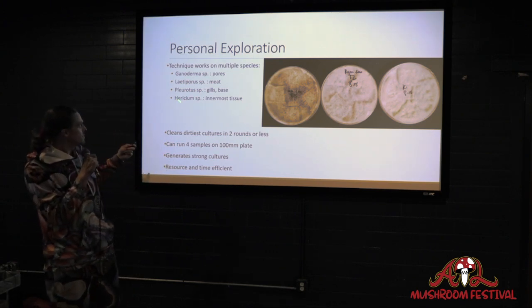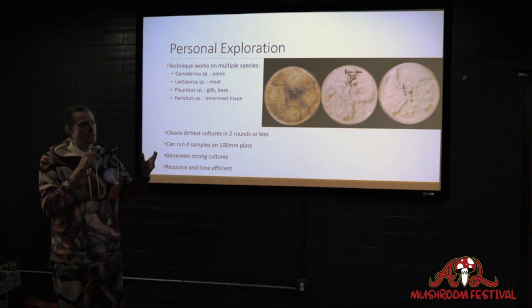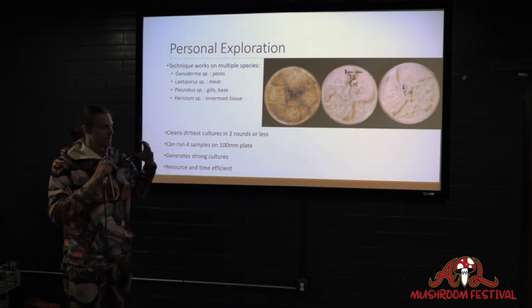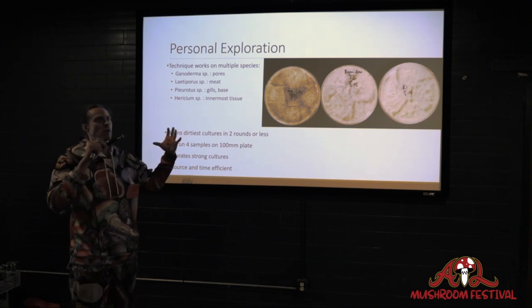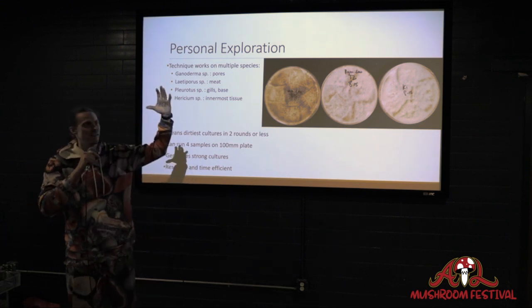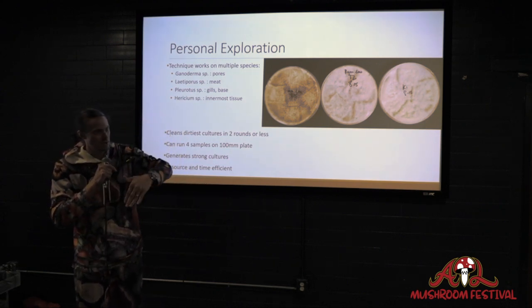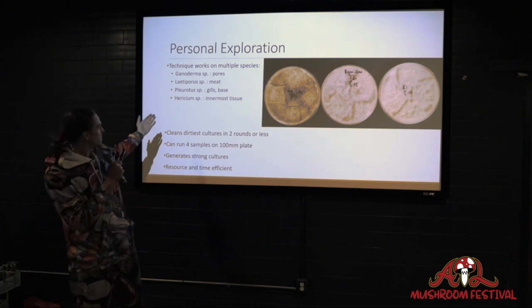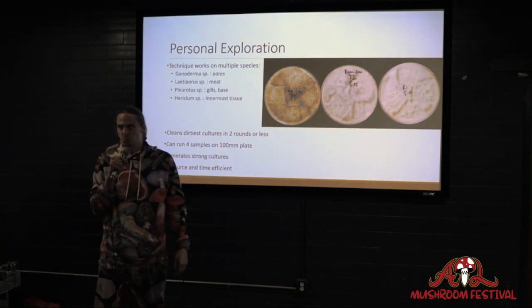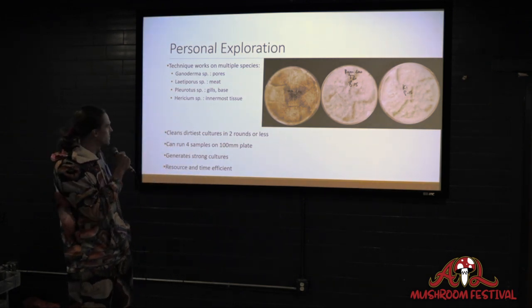And then for lion's mane, you always want to try and dig as deep into the center of that mushroom as possible. Because of how porous lion's mane is, it's just like a giant ball that absorbs, like a sponge. So if there's any sort of moisture, rain, water, it's going to absorb all of that. And guess what follows water? Bacteria. Guess where the bacteria is? On the outside, in the air, in the water, on the ground. And if it's on the mushroom and the water pushes it into the mushroom, then now it's in the mushroom too. So, especially with lion's mane, I try to dig as deep as I possibly can, getting to the very, very, very center of the mushroom where it's probably the most sterile, and I have the greatest chance of getting some growth going that I can then put through this technique.